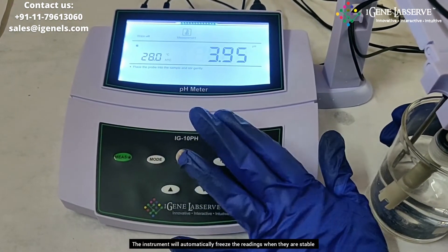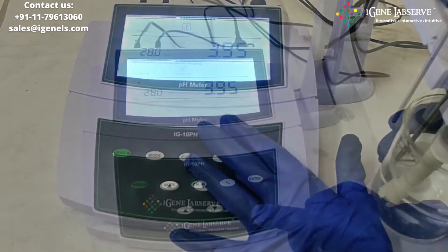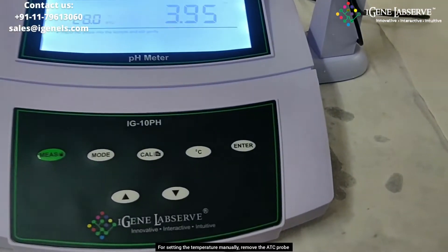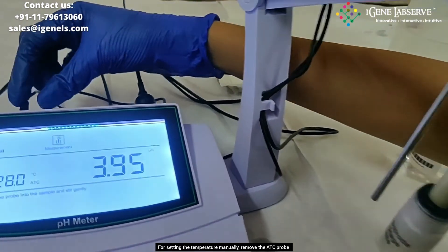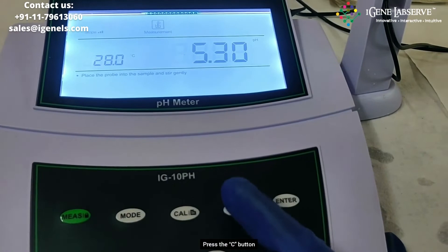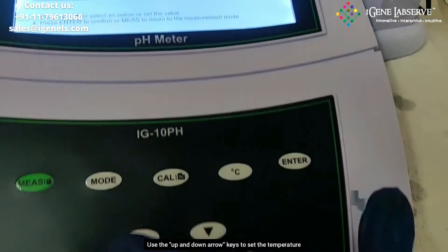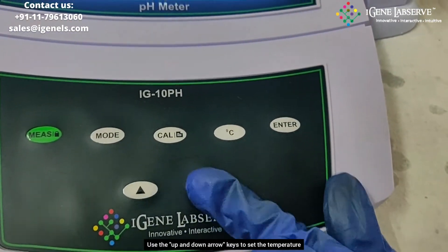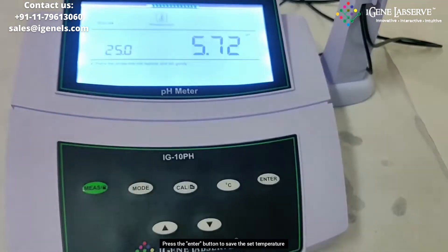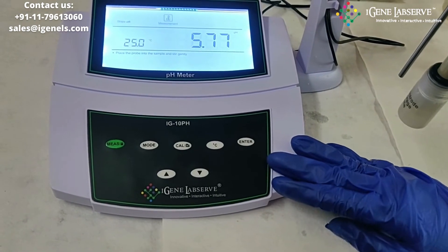After some time, the machine automatically holds the readings when it detects they are stable. If you want to set the temperature manually, you can remove the temperature probe and set the temperature manually using the degree Celsius button. Use the up and down arrow keys to increase or decrease the temperature, then press the enter button to set the desired temperature. This is how the IG pH meter works.